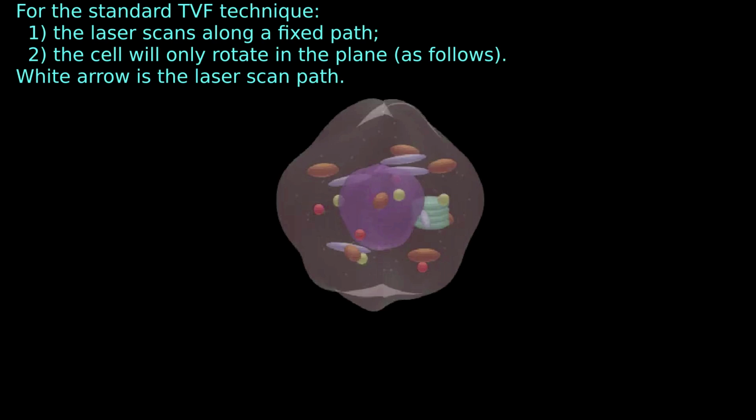TVF stands for thermoviscous fluid. So you would put your suspected cancerous cell into a thermoviscous fluid. In other words, one where the viscosity of the fluid depends on temperature.